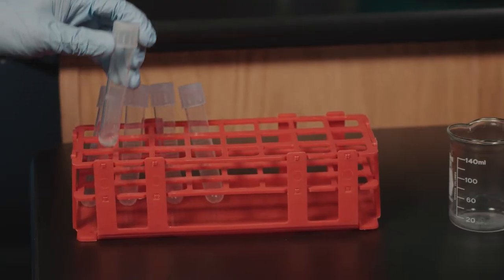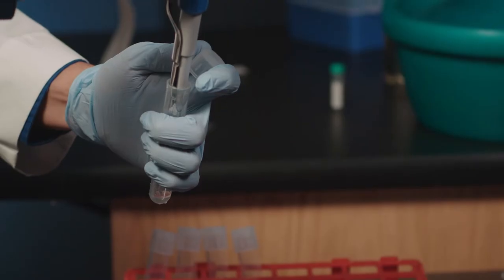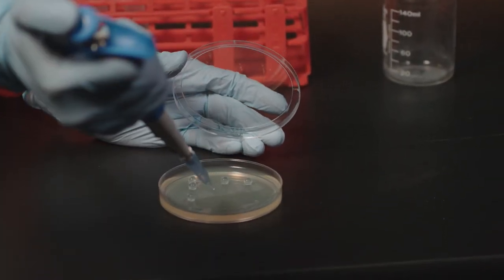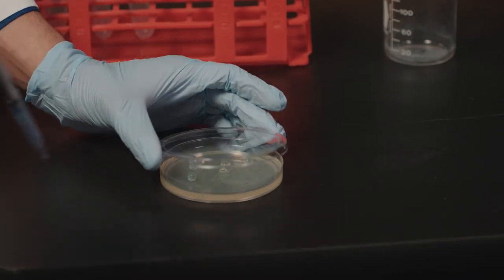Transfer 100 microliters of cells from your transformation tube onto a petri dish containing 4 to 6 glass beads. Then use a back and forth shaking motion to spread the glass beads across the plate. Do this for 3 to 5 minutes.